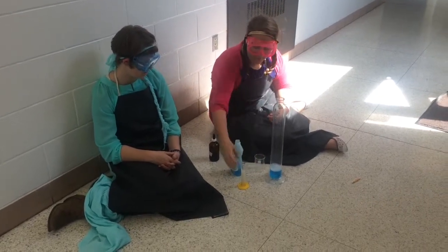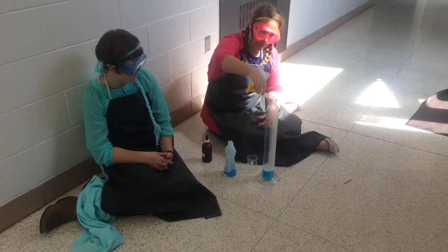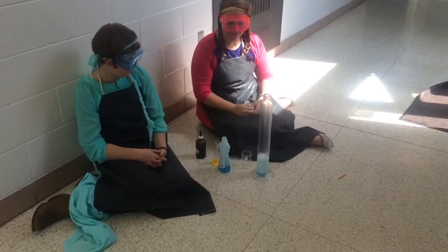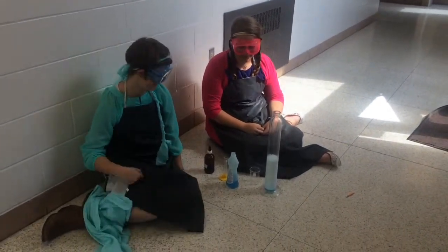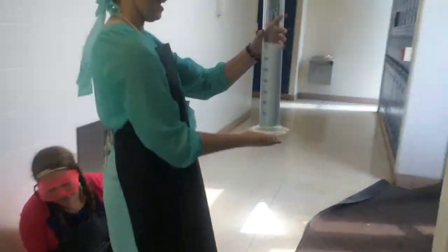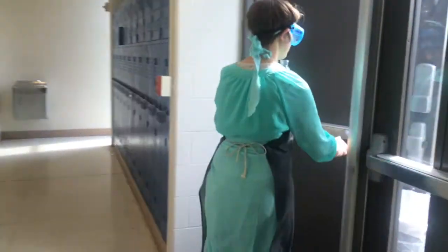And now we're going to add 25 milliliters of yeast. So as you can see, this reaction is reacting a lot faster than the potassium iodide did. And so we don't make a mess, we're going to venture to the outdoors. But as you can see, this is reacting faster, which proves that the myth is a real thing.